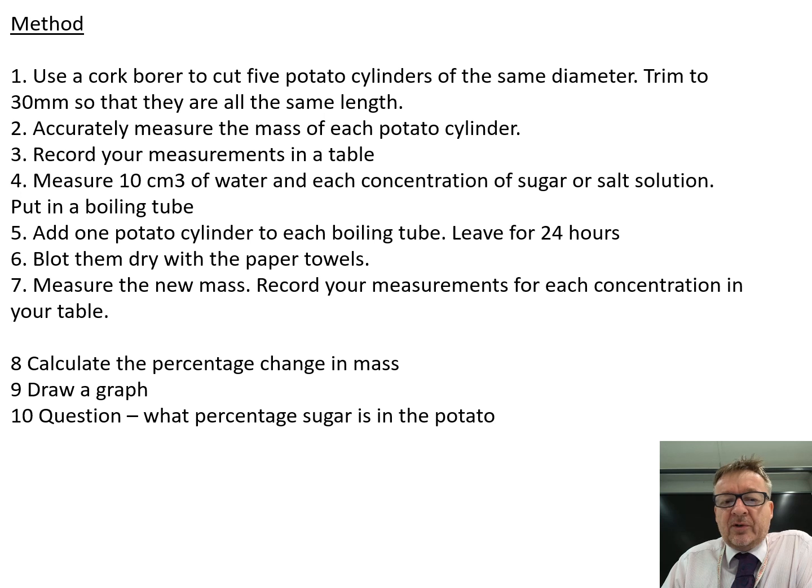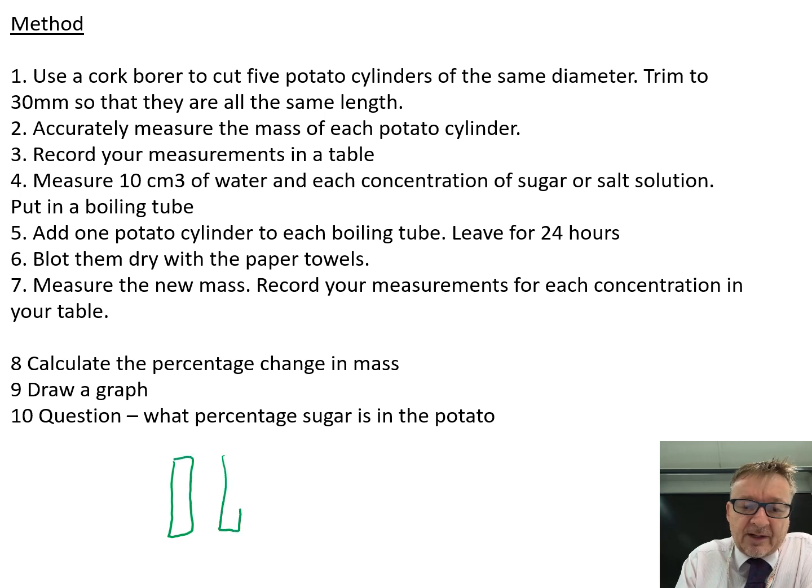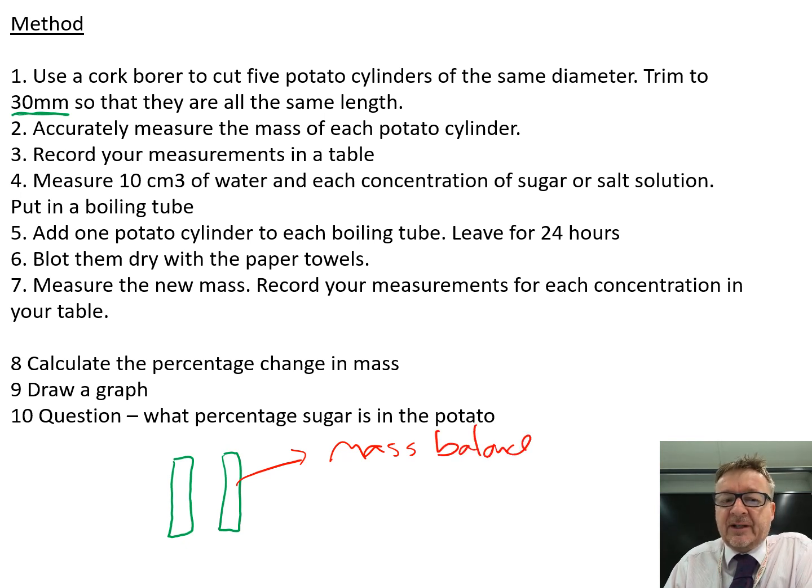Step one: use a cork borer to cut five potato cylinders of the same diameter. You'll get five pieces of potato the same diameter but different lengths, so use your ruler and scalpel to cut them all to 30 millimetres. Step two: accurately measure the mass of each cylinder on the mass balance and record your measurements in the table.